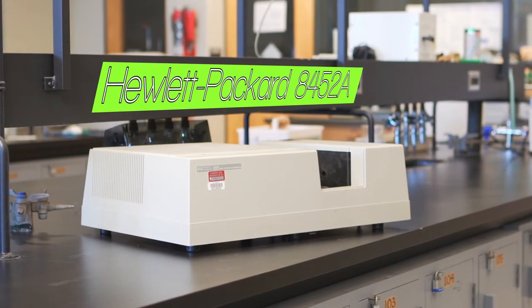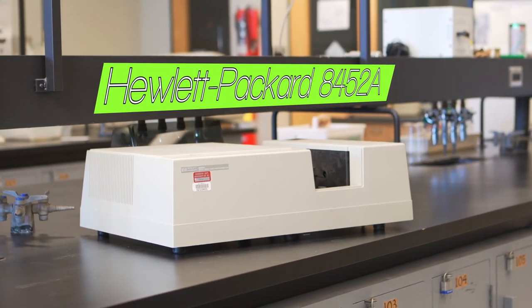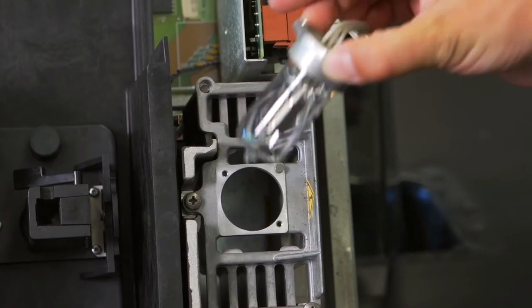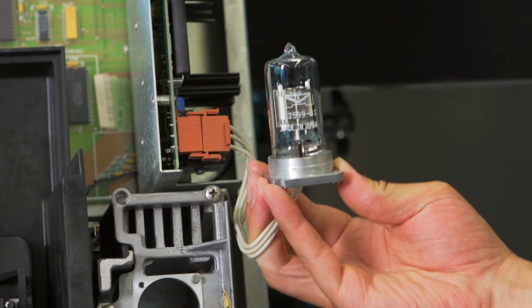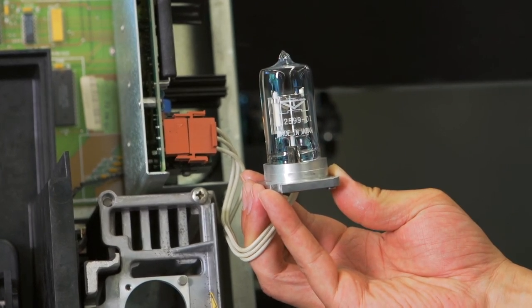Now we'll take a look at the HP 8452A diode array spectrophotometer. A deuterium lamp is the source of light for both UV and visible wavelengths. The output in the UV region is high, whereas there is less intensity in the visible region. Although the deuterium lamp is weak in the visible region, it still works reasonably well, and allows the instrument to be simpler and cheaper.